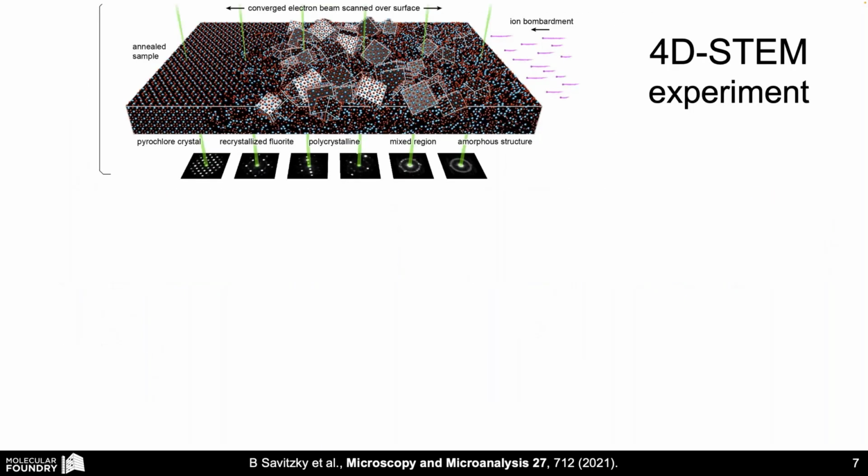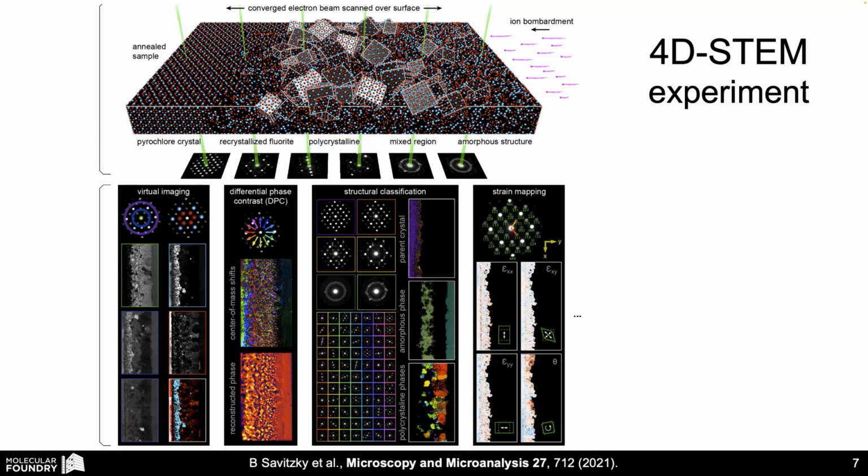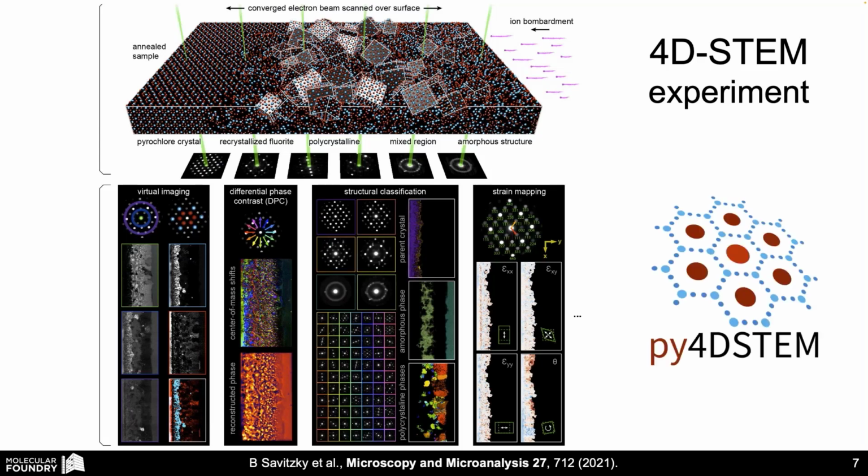So our 4D-STEM experiments, Anna already sort of demonstrated how we record them using the Gatan STEMx setup here. What I'm going to be mostly showing is examples of different material science properties that we measure, and that's done using our py4DSTEM open source Python toolkit for 4D-STEM analysis.